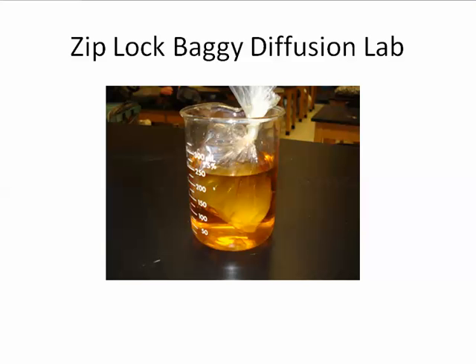If you remember, there are several factors that influence permeability: the concentration of the solution, the electrical charge of the molecules, the shape of the molecules, and then certainly the size of the molecules. And that's the factor that we're going to be considering today. Which molecules are small enough to pass through the holes in the Ziploc bag, the pores in the Ziploc bag, and enter into that beaker of water.